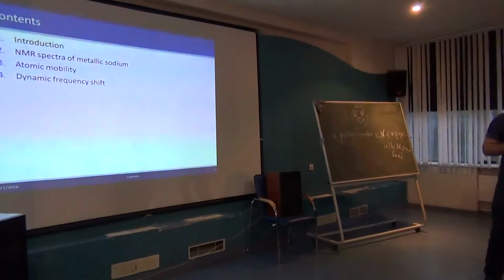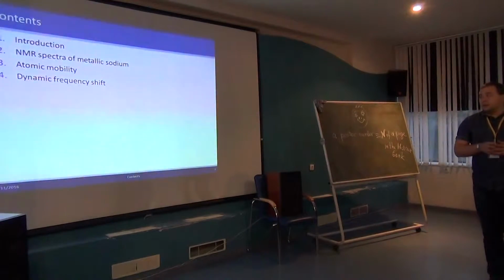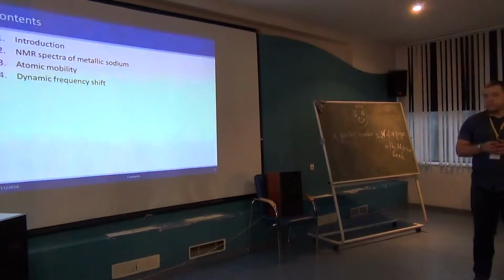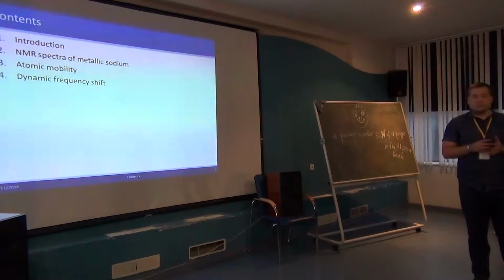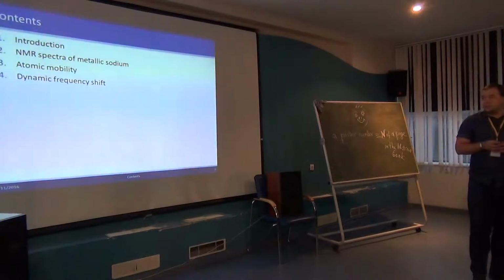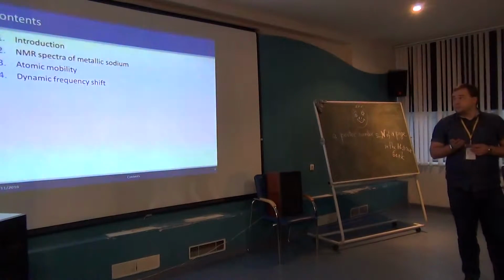Firstly, I'll tell a few words about present results on investigation of different atomic composites, and then we will turn to properties of sodium, basically its NMR spectra, and then we will turn to investigation of atomic mobility and dynamic effects.